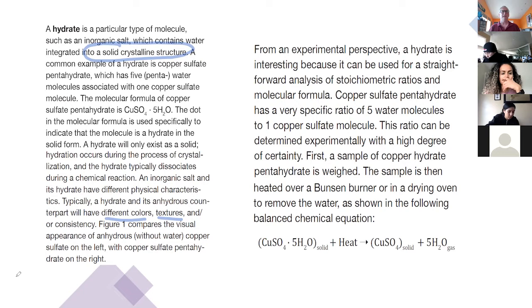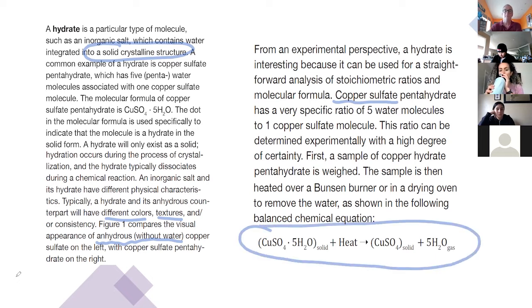And when you have anhydrous, which means without water, hydrous meaning water, anhydrous means basically you've driven all the water off. And so we can see that there is generally going to be a ratio of the particular salt we're dealing with and water. This is copper sulfate down here at the bottom. Copper sulfate pentahydrate. What does penta refer to?